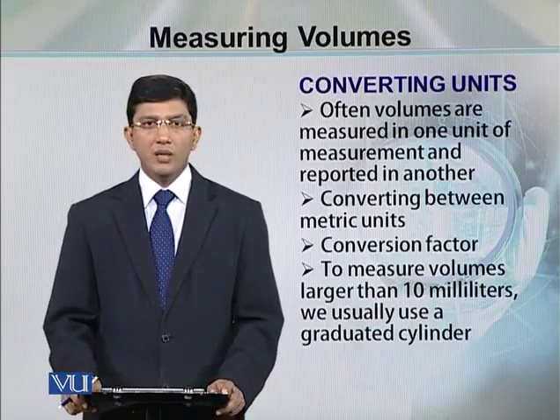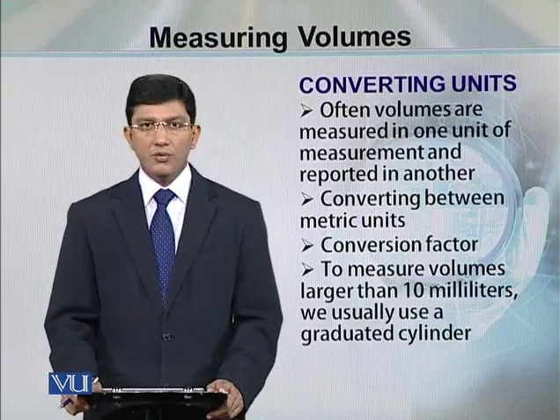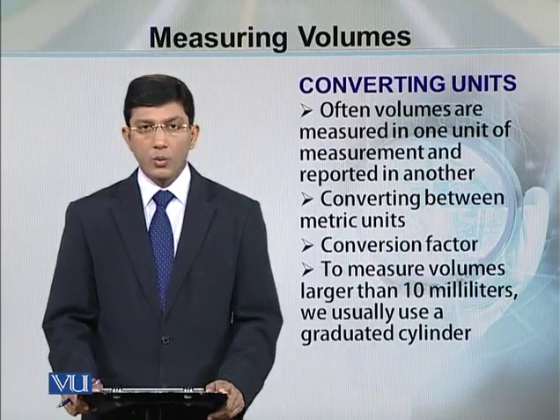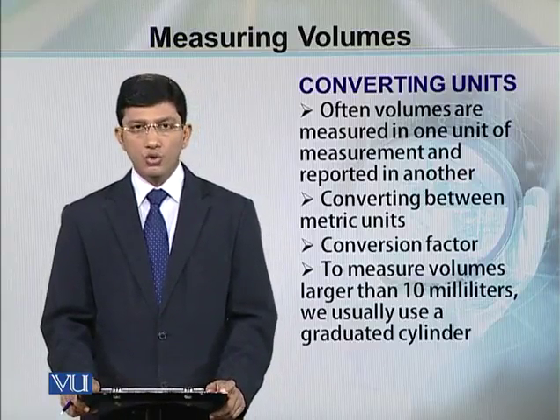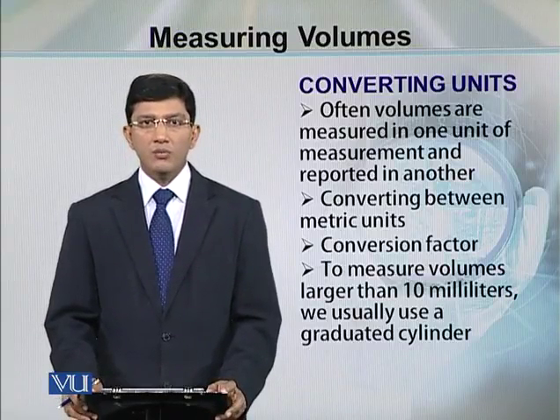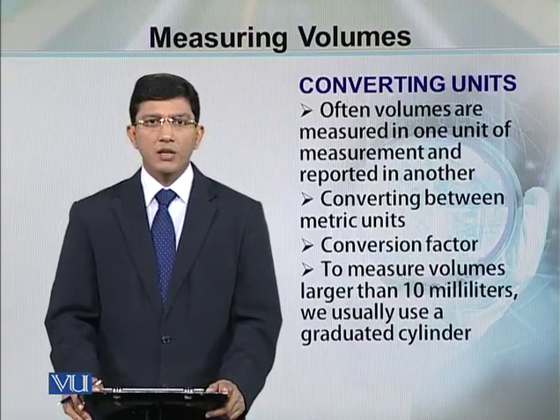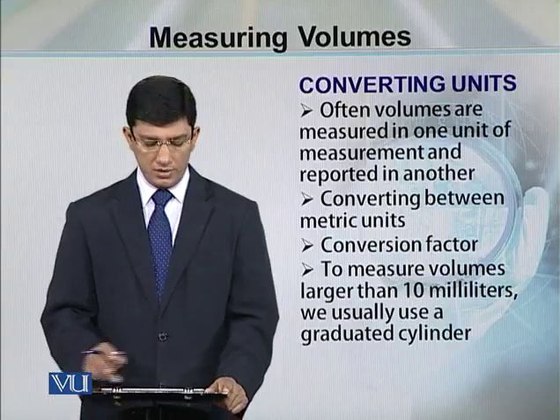Often we measure the volume in one unit and we report it in another unit. For that purpose, a student must practice converting between metric units, know the conversion factor, and know which volume should be measured by which piece of equipment. Normally volumes less than 10 milliliters are measured by pipettes, and volumes more than 10 milliliters are advised to be measured by graduated cylinders.